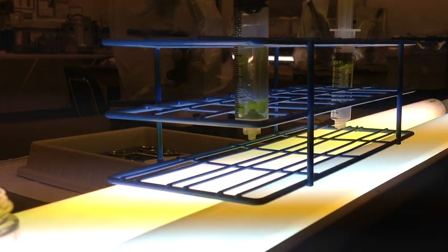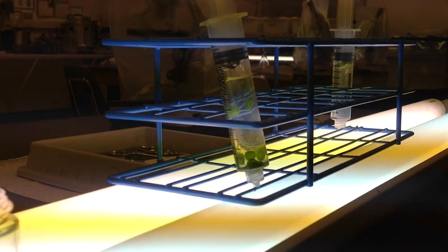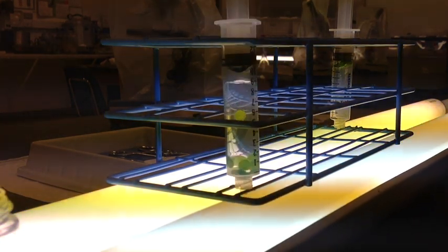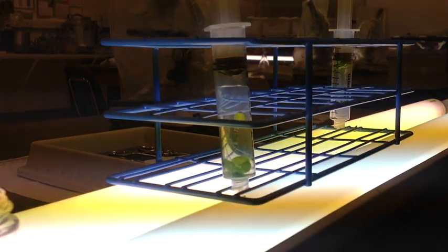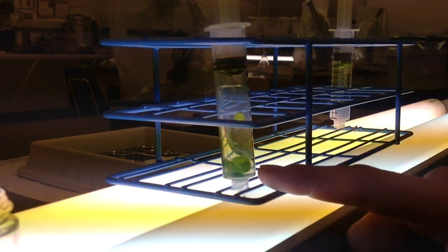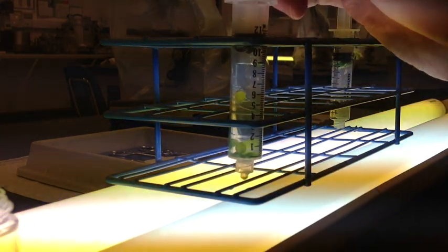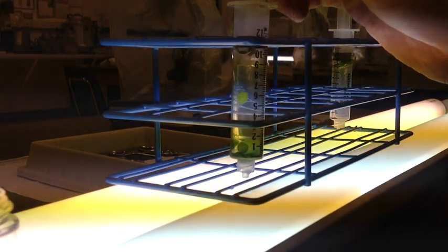Next, add your syringe with your leaf discs to a well-lit location. You are checking to see how long it takes for at least 5 of your discs to rise to the top. Some discs may be stuck to the side — either tap them gently or disregard them from your count. Time how long it takes for 5 discs to float from the bottom past the halfway point, which would be past the 5cc mark. Once 5 leaf discs have floated above 5cc's, mark your time.